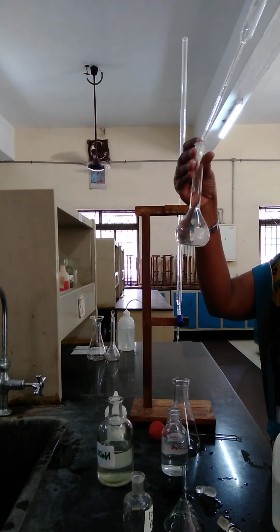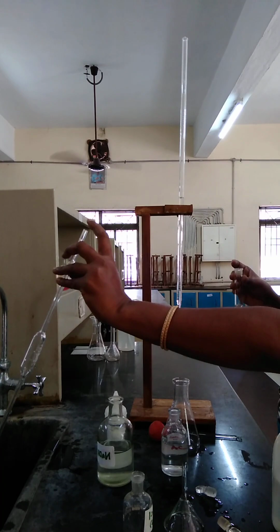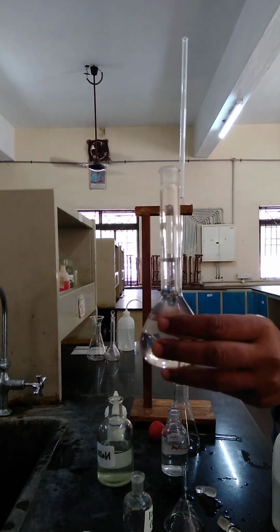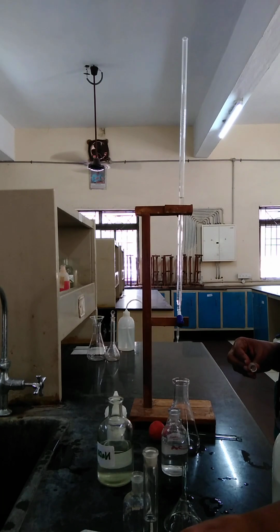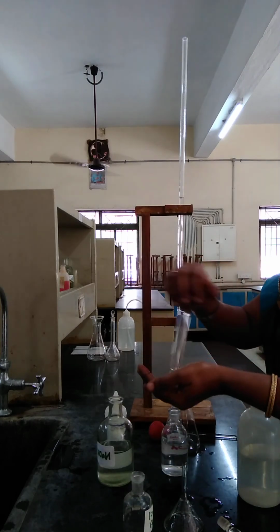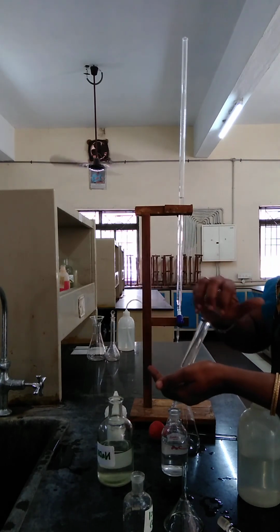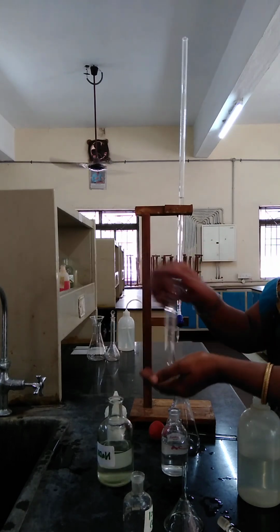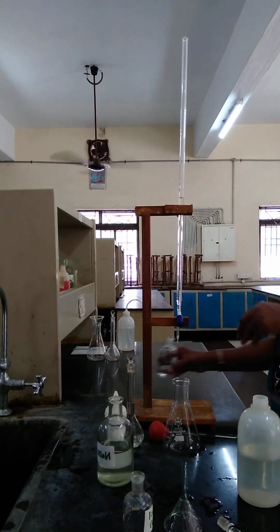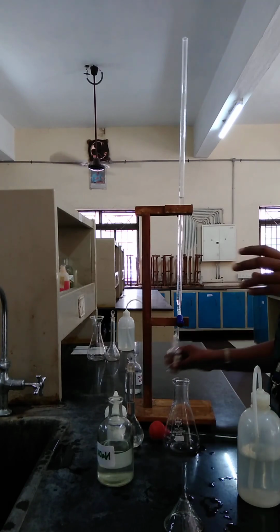Keep the standard flask at your eye level. Then only can you see the lower and upper meniscus very clearly. Yes, exactly, done at the lower meniscus for the colorless solution. Now you can shake once again very well to get a homogeneous solution. Hold it in the other hand, then shake from the bottom. Then only it gives more space to get homogeneous. Two to three times is more than enough. Now the sample is ready.